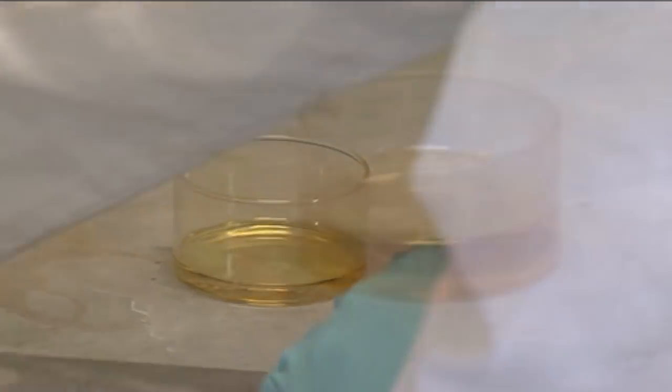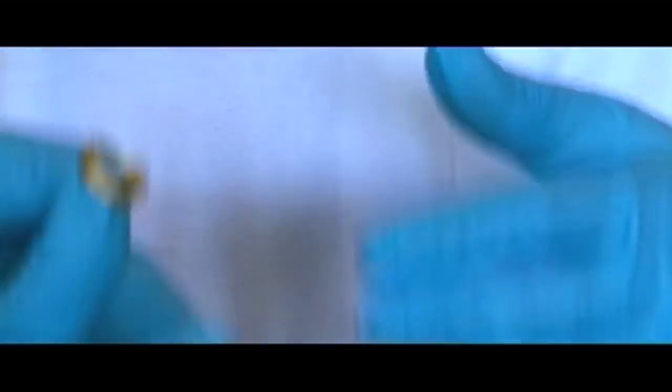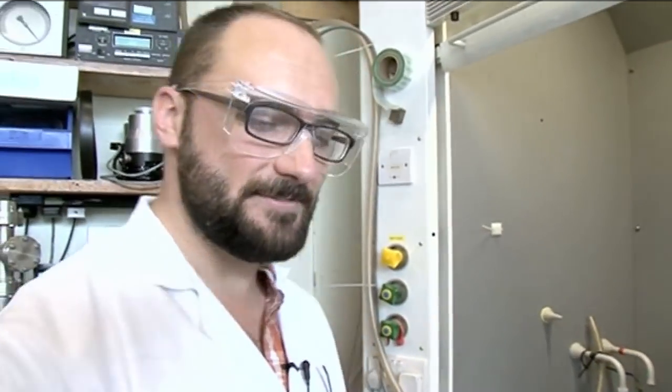Wow — those are the fumes that came off the nitric acid. Of course, we're using a fume hood because the fumes that come off the nitric acid are quite dangerous. Let's put some gold in aqua regia. For the gold, we're just going to use this ancient priceless Egyptian relic. All right, let's chuck it in there. Gold in aqua regia.